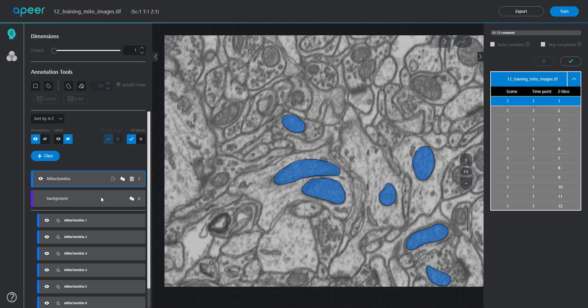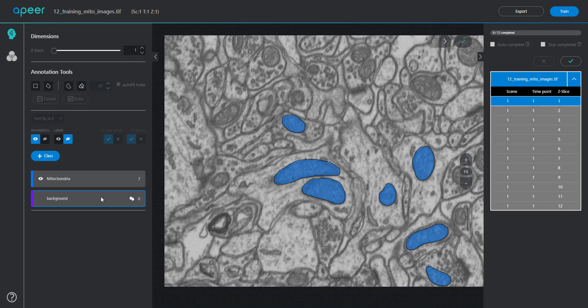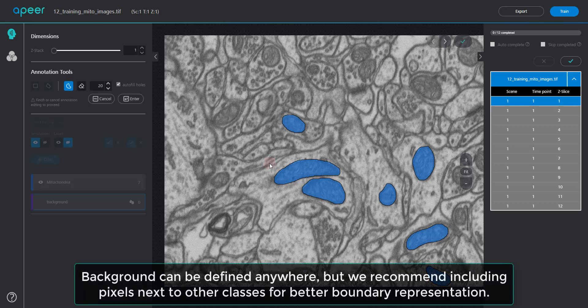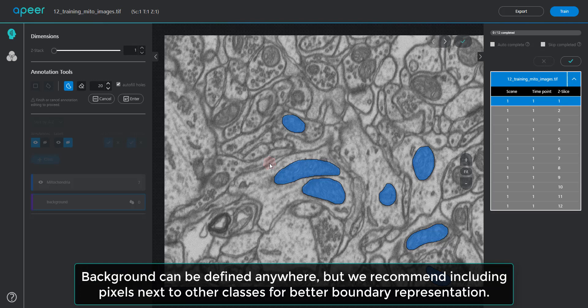To define the background, select the background class and an appropriate annotation tool, and define the background around annotated objects. And hit return or enter.